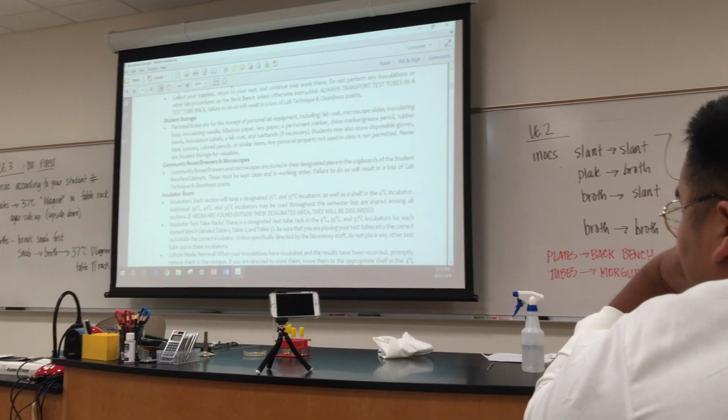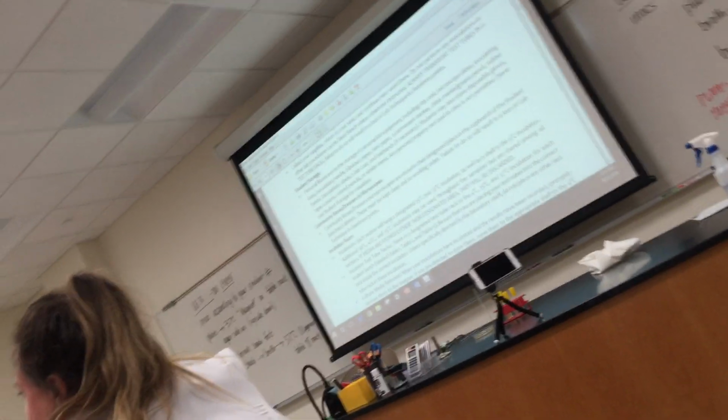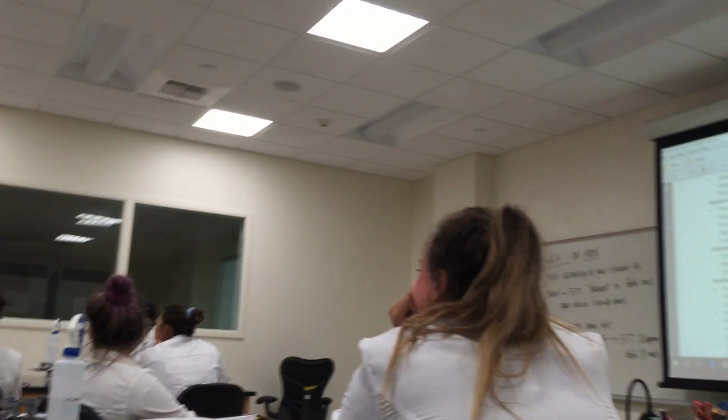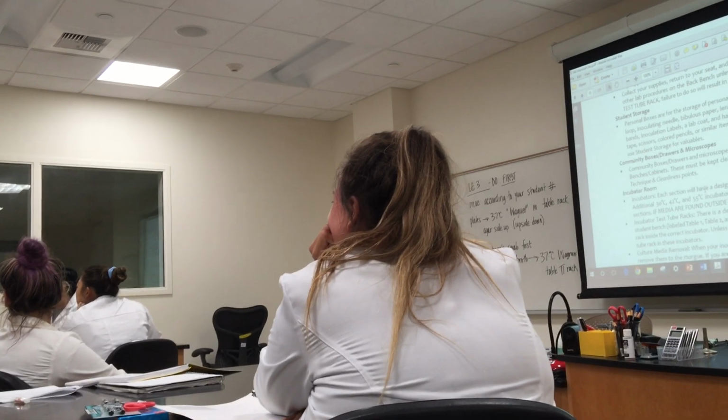So this is our lab space. This is our incubator room, right? Incubator room, fun acoustics. You cannot hear anything out here, but we can hear everything you say in there. So just keep that in mind. If you're talking smack about your teacher, don't do it in the incubator room.